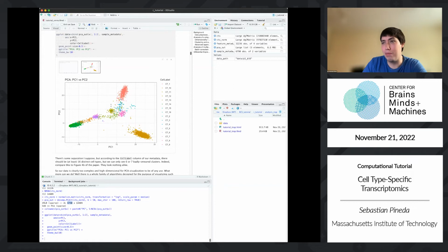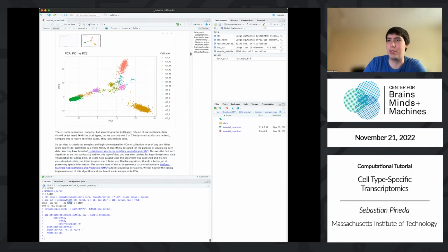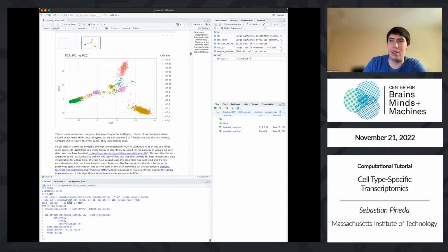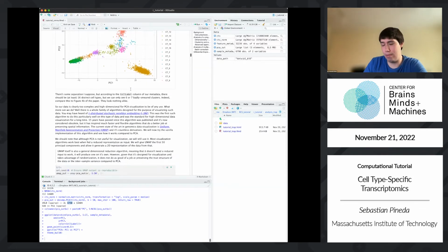So this is what people used to do. You look at the very early single cell papers, and if I were to tell you, oh, there's 45 distinct cell populations in the human motor cortex or the mouse motor cortex, you wouldn't. This is striatum. There's maybe like 30 something. You wouldn't be able to get that information from doing this sort of a naive analysis.